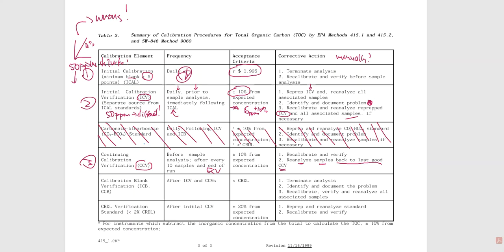And I also said, listen, sometimes if it happens at the end and no more samples are coming around, and then we do an end one for real, then we abbreviate that as the ECV, the end calibration verification, just to have maybe some insight that, yeah, this is formally where this batch is going to stop. All right, so number 4, this is where we're picking up more QCs.